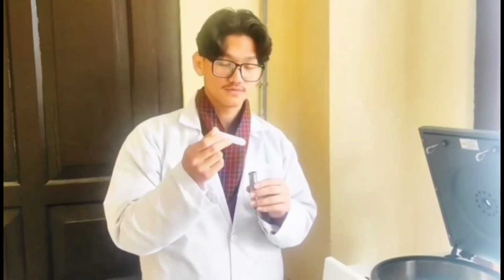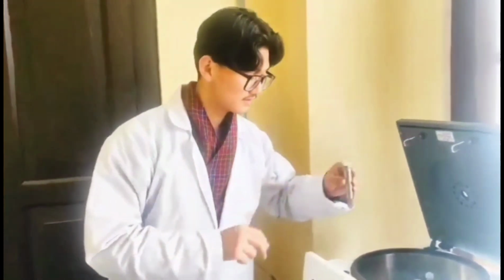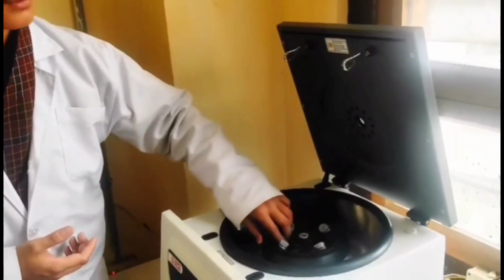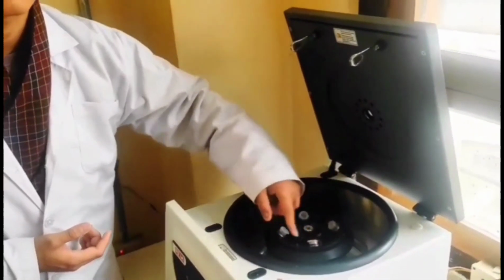Now when we collect the sample from the sample tissue, we put it inside the test tube and we put the test tube inside the test tube bucket. And we place the test tube holder inside the rotor. The rotor is connected to the motor, which helps it to rotate. Moreover, the space in which the rotor rotates is known as the chamber.